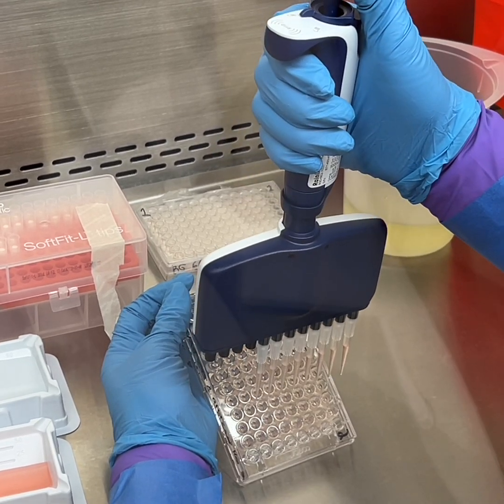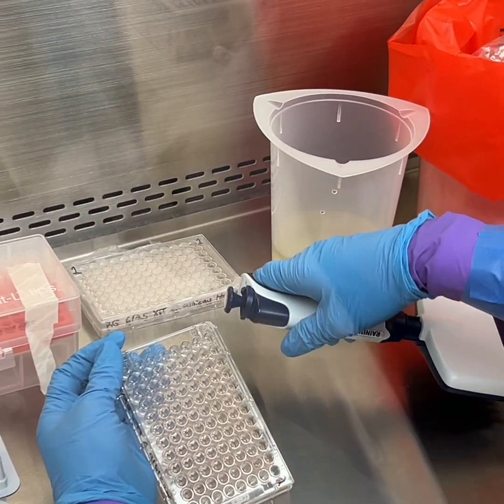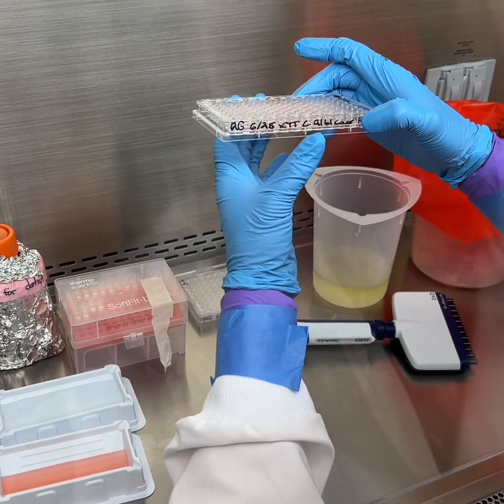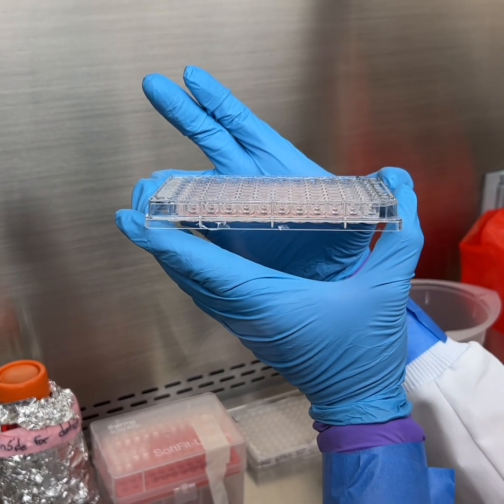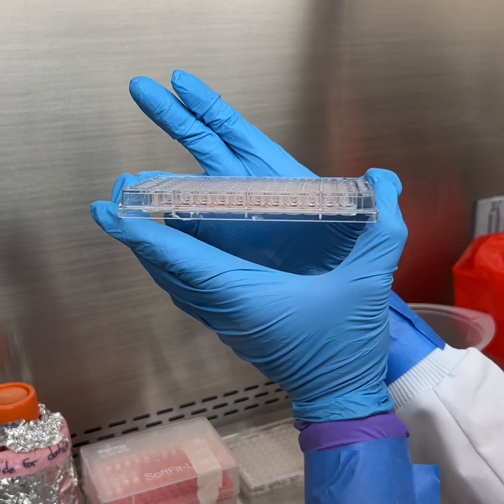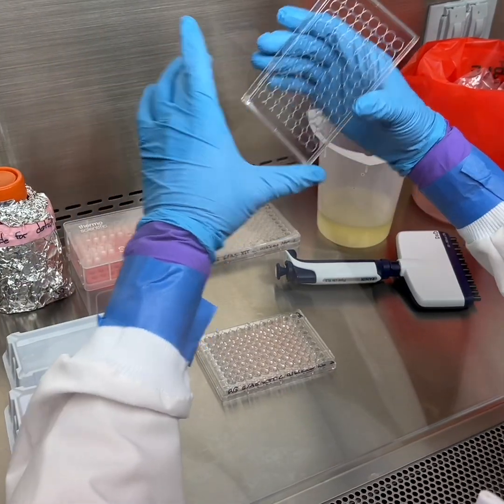Okay, and I'm not going to add any to 11 because that is our positive control. So I'm just going to trash the last 100 microliters. You'll see, well, it's hard to see on that side, but there's 100 microliters per well except for lane 12, which is our negative control. Okay? So now you will cover and parafilm.